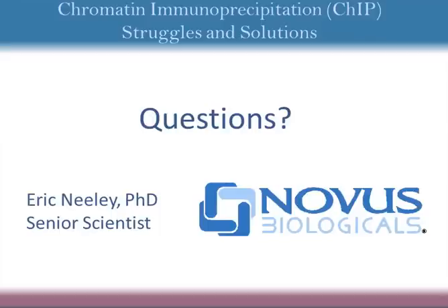You should have a lot more pull down from that versus doing a modified antibody or transcription factor, but it should work just as fine, and it should actually work even better. You just have to be really careful about your background again and making sure that your no antibody control or IgG only control isn't pulling up anything with it. Okay.